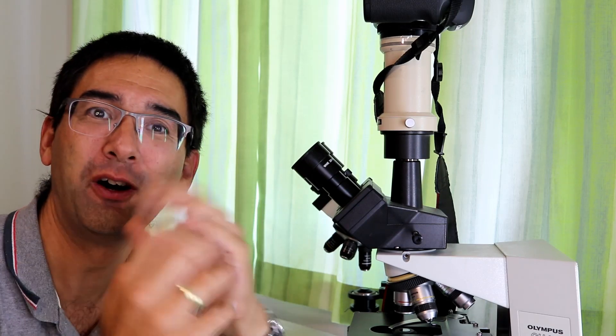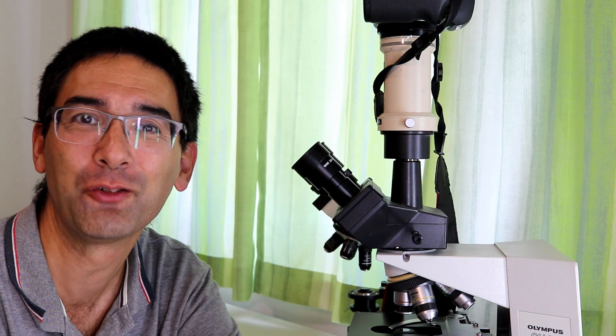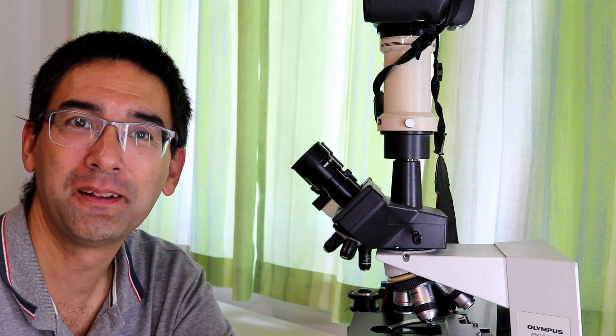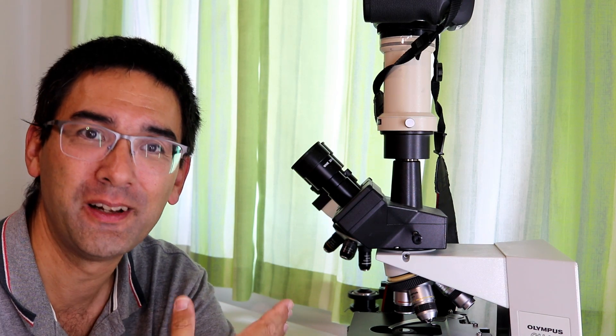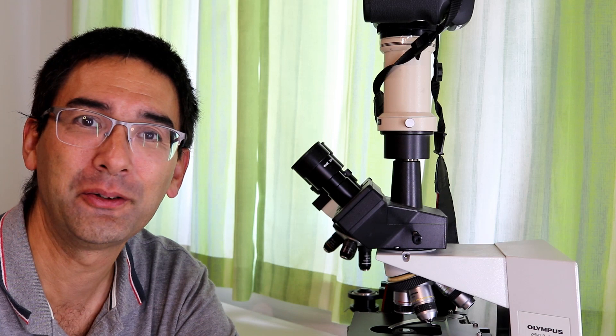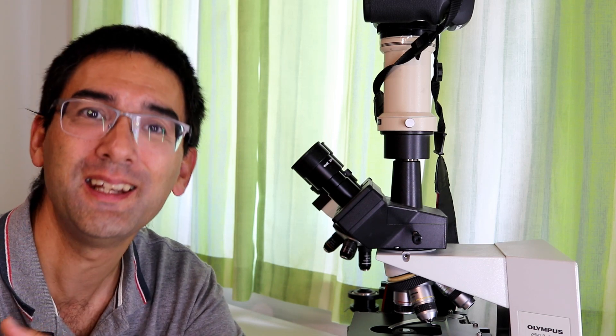This was cotton candy under the microscope, one of the most unconventional specimens I've ever observed. My recommendation is: if you find anything interesting that you're curious about, and if it's sufficiently small, thin, and transparent, just put it under the microscope. In the worst case, you won't see anything.